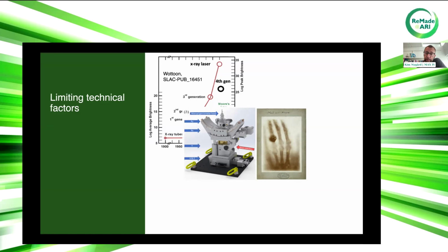And then you also need fast stages for quickly scanning your sample to make use of the fast detectors and the high X-ray flux. So in principle, you can do these experiments at any SWAXS beamline, at any synchrotron, but in practice, some instruments focus more on the traditional SWAXS experiments, and some focus more on scanning SWAXS experiments.